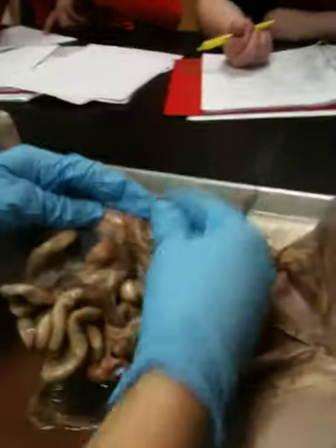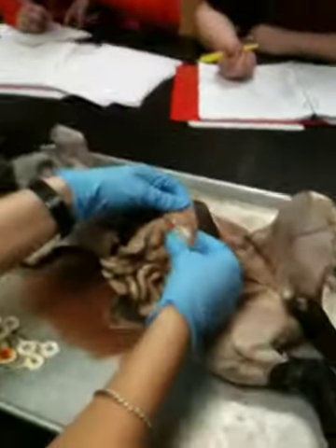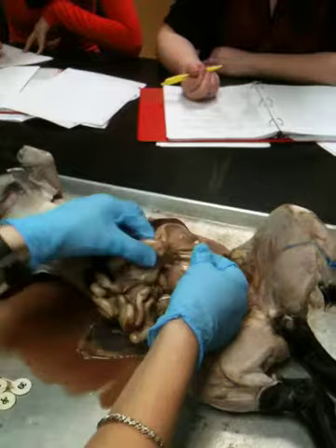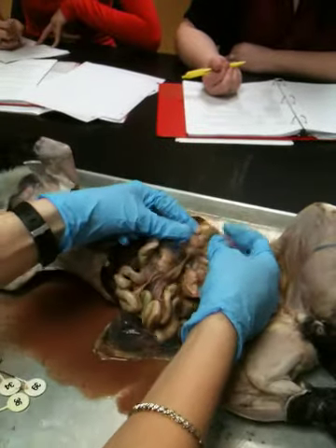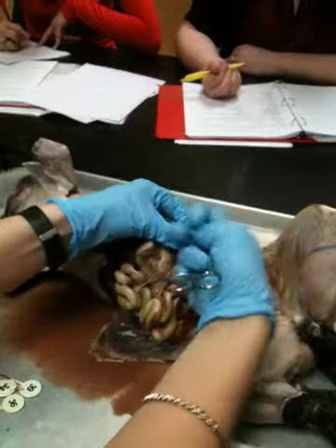And then you'll see another texture change. You can see here I got a big fat flat thing with not much, when you feel it, you'll be able to tell the difference. This has got a ropey texture to it, and this is very flat and much broader. So this is the junction here. You can see this is small intestine, and that's what large intestine looks like. Totally different fabric.